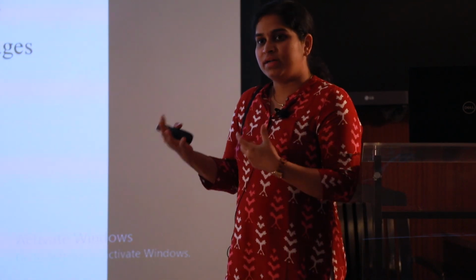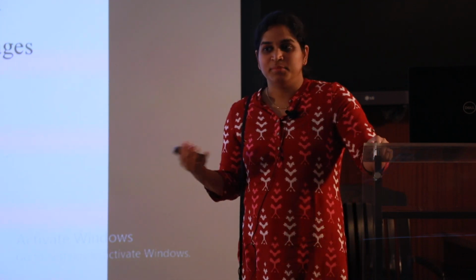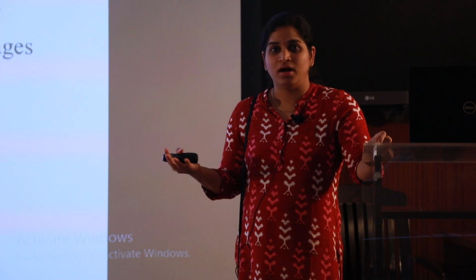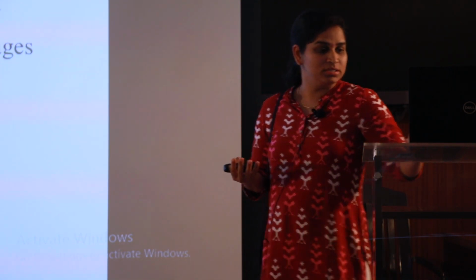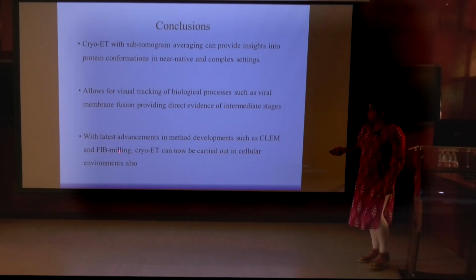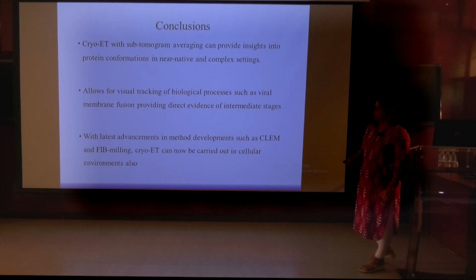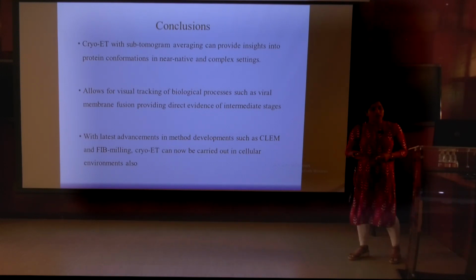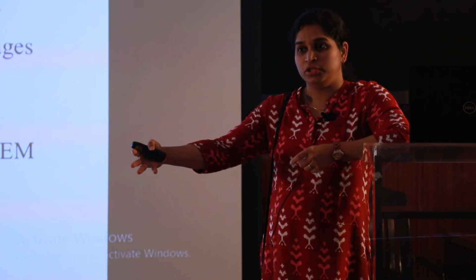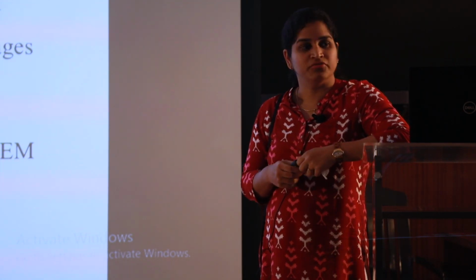We can look at how viruses enter and how viruses exit, for example. All of my examples are viruses because I'm a virologist, but these methods can be applied to many other systems, and almost all biological systems have now been studied using them. This is one of those fields that is moving very fast nowadays, with many more methodologies being added to the cryo-electron microscopy pipeline, which makes sectioning and looking at things all the way up to the nucleus, the thickest part of the cell, actually possible, so that we can get high resolution information from it.